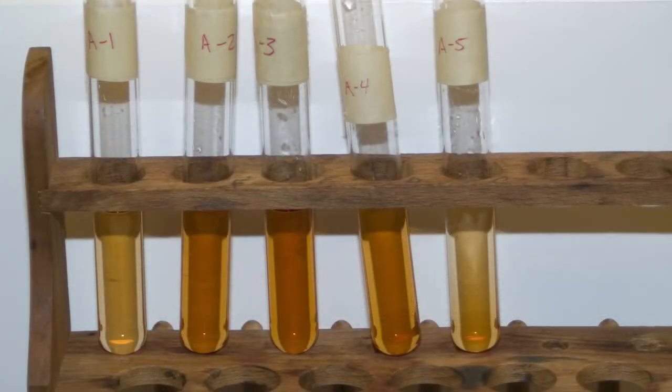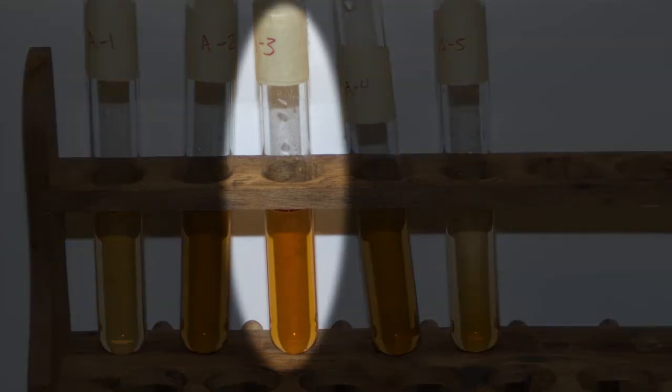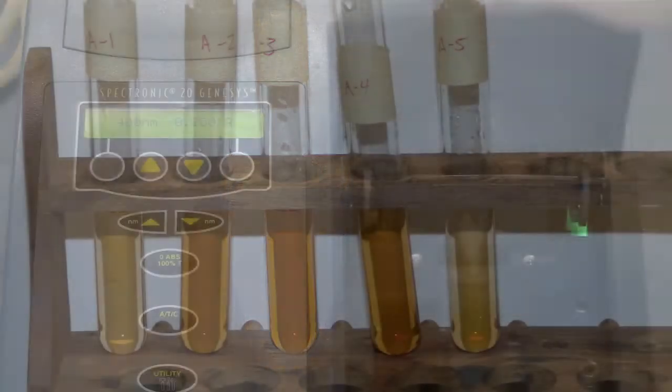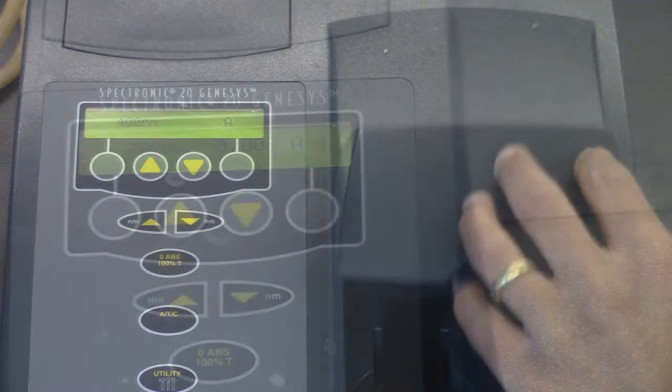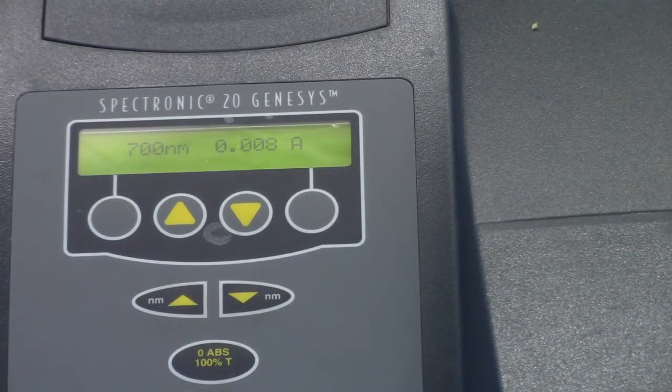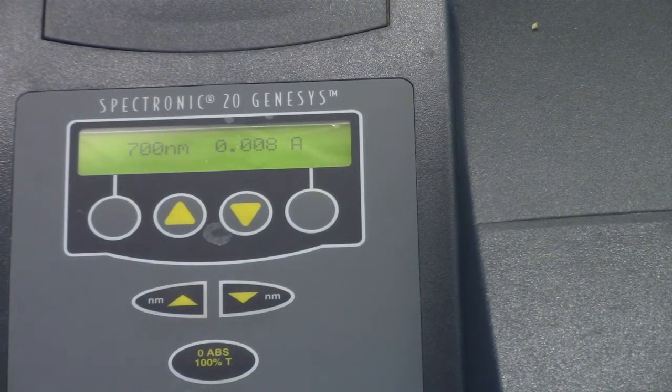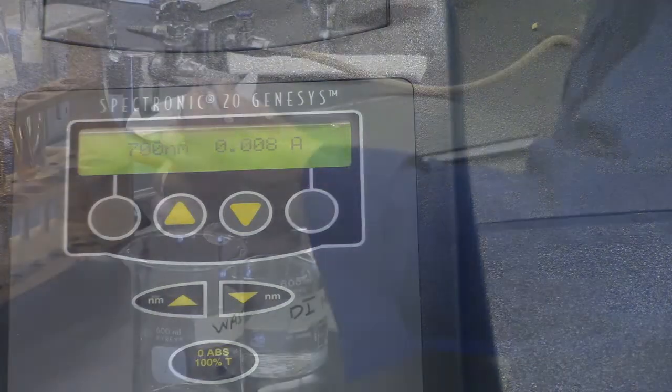To find out which wavelength that is, we will use sample A3, the 50-50 mix of iron-3 and thiocyanate. The range of wavelengths tested will be from 400 nanometers to 700 nanometers in 25 nanometer increments. Record the absorbance at each wavelength.